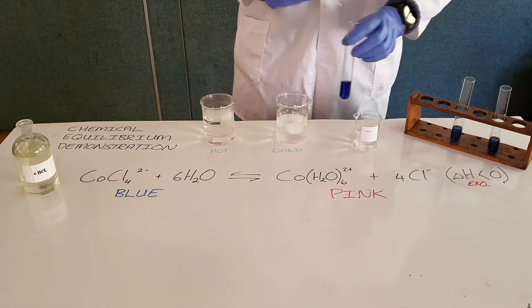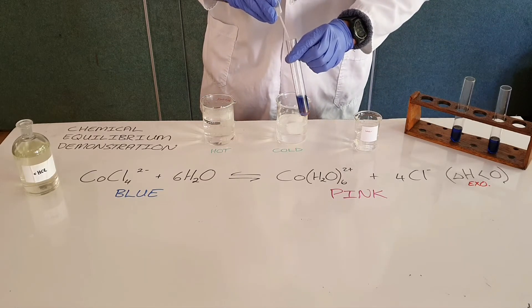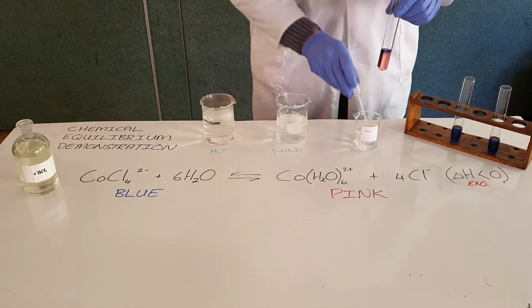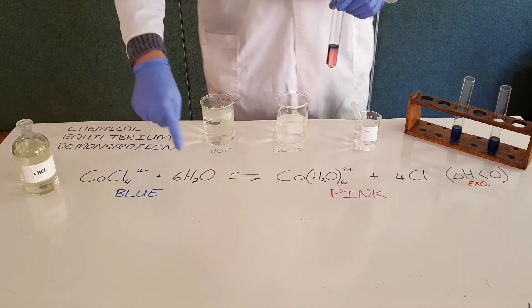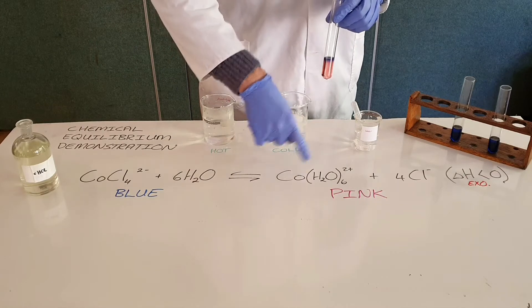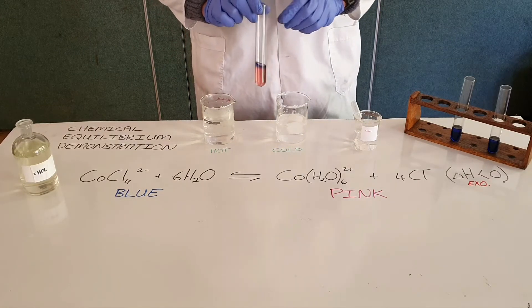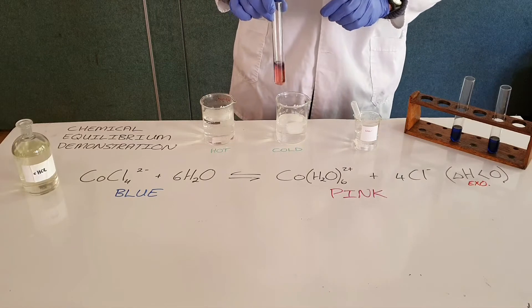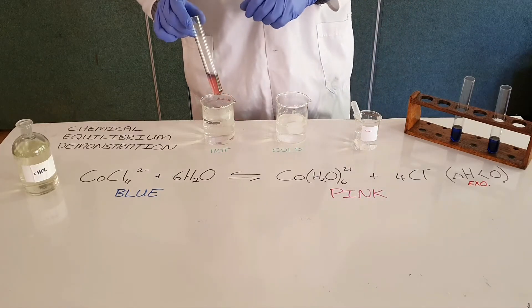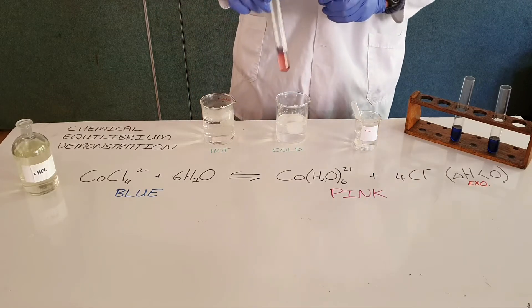We are going to add some water to this solution, which sets the forward reaction in motion. The forward reaction — cobalt chloride plus water — produces cobalt hexahydrate and chlorine ions. As we can see, we have formed a slightly pink solution, and it is at equilibrium where there is a certain amount of blue still present in the solution.